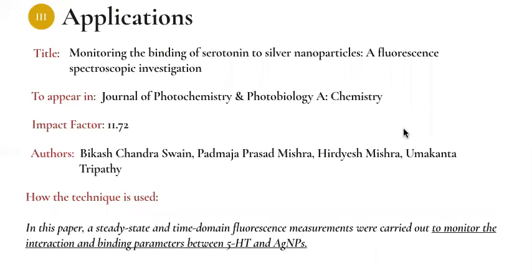So the next study is entitled as follows: Monitoring the binding of serotonin to silver nanoparticles, a fluorescence spectroscopic investigation. This appears in Journal of Photochemistry and Photobiology, with an impact factor of 11.72.